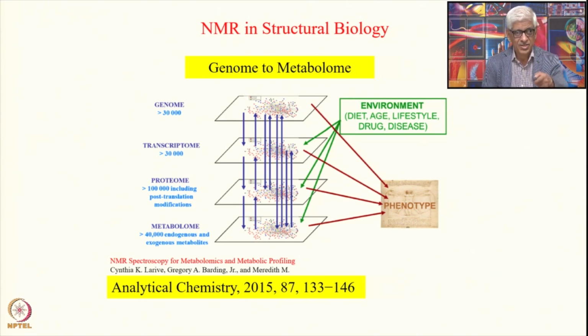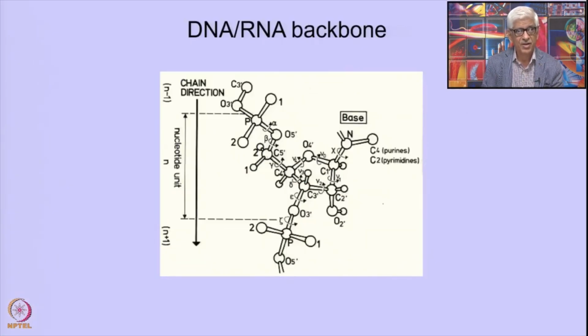There are many challenges, and of course now NMR has come of age to provide solutions to many of these situations. So in order to see how one can apply NMR, we will have to go into the details of the individual molecular structures. So let us begin with the RNA structure or the DNA structure.